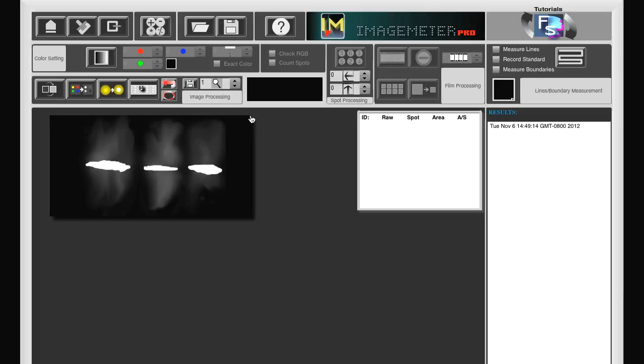Here we have a blot where we have three bands. If we want to have a quick estimate of the different band intensities, we first create rectangles around the bands.